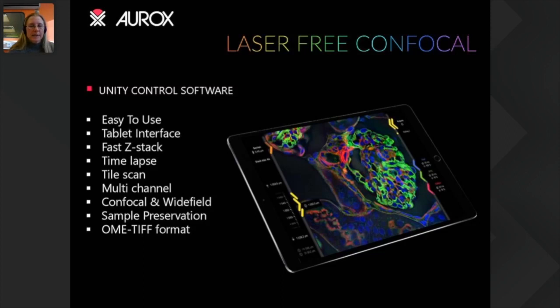And just a very quick question that popped up. When changing the objectives, do you need to change out the Aurox disc?